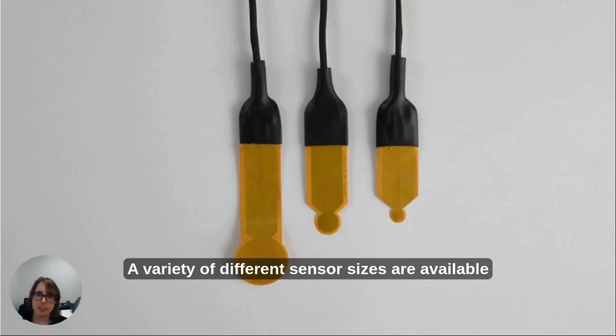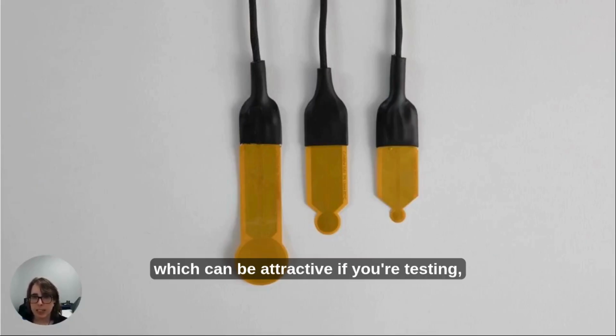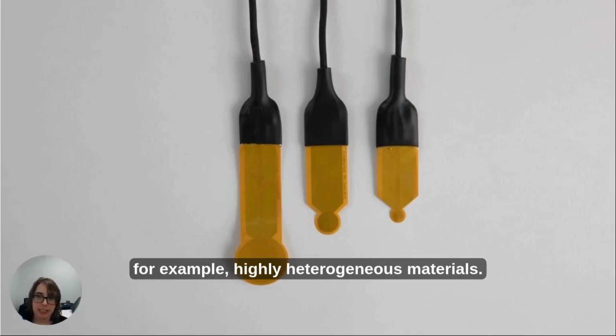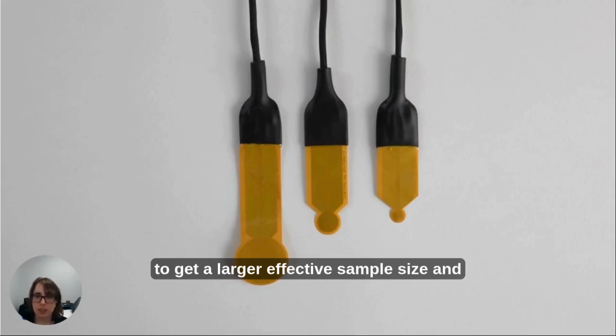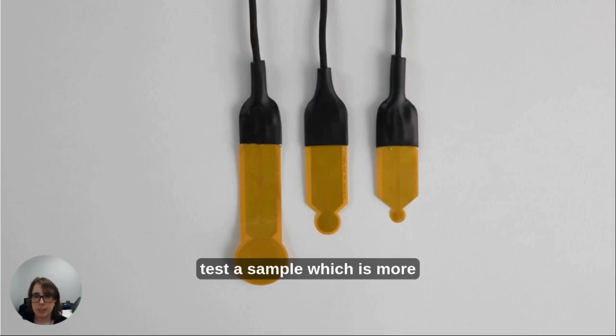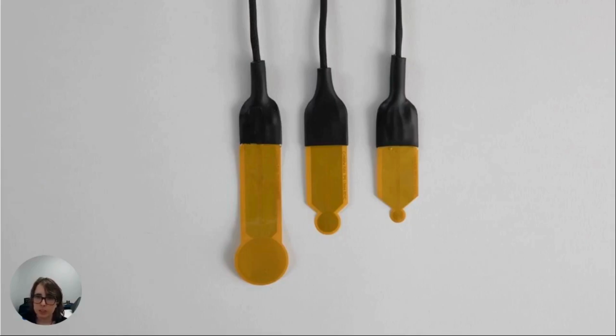A variety of different sensor sizes are available with this method, which can be attractive if you're testing, for example, highly heterogeneous materials. You can use a larger sensor size to get a larger effective sample size and test a sample which is more representative of the bulk average properties of the material.